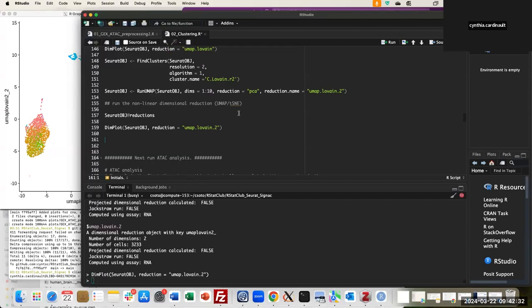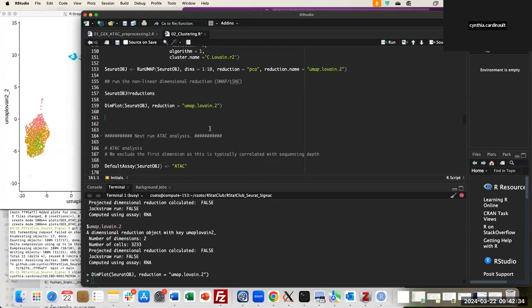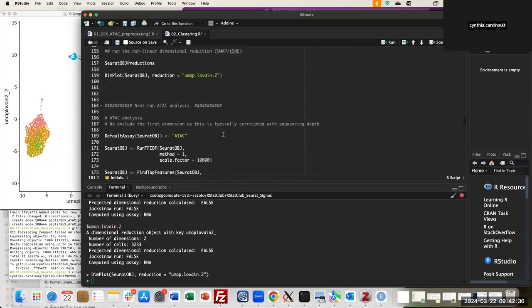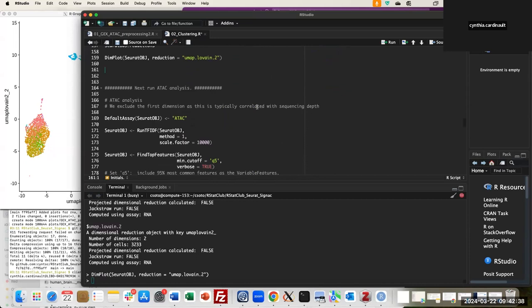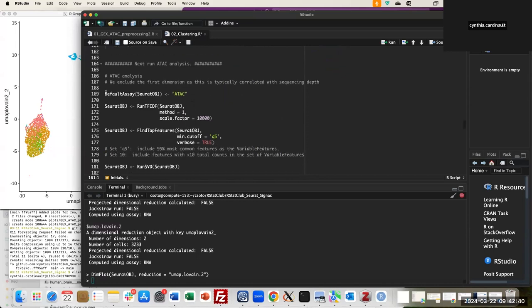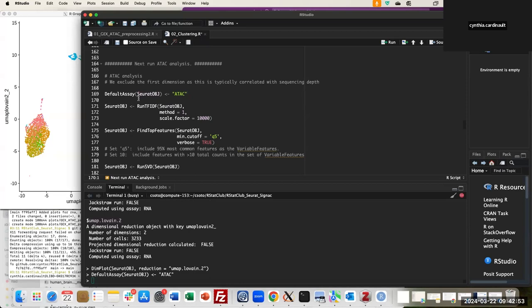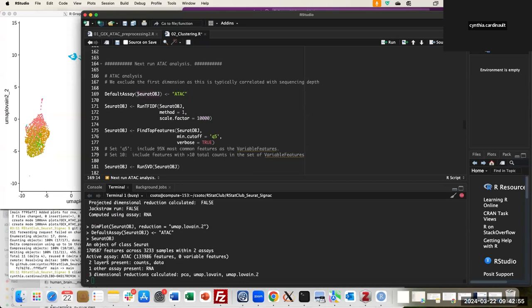Now the other two steps are very fast because they are derived from the same approach. The only difference is that I change the active assay to ATAC. I use DefaultAssay with the object and change it to ATAC. Looking at the data, the active assay is now ATAC.